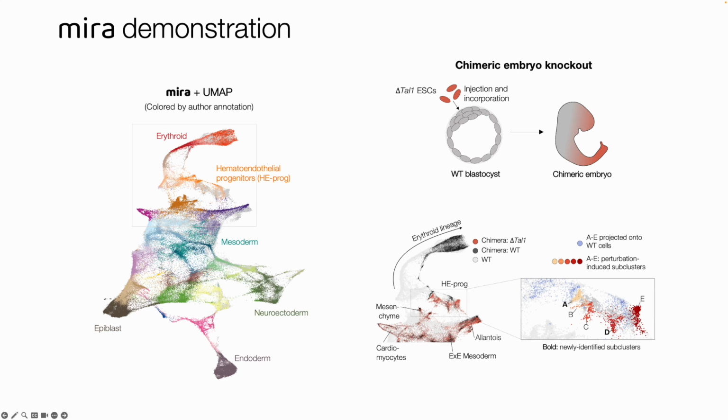To conclude, the Mira package for single-cell multiomic analysis and regulatory inference is now equipped with the CODEL algorithm for integration and characterization of perturbation experiments. We anticipate that this will be a useful tool for dissecting complex regulatory circuitry.